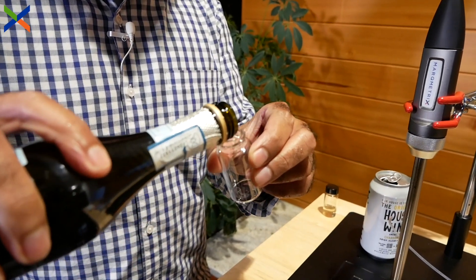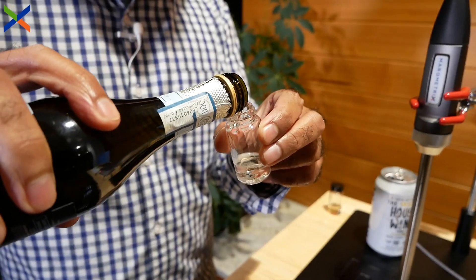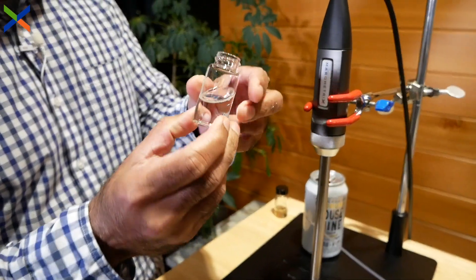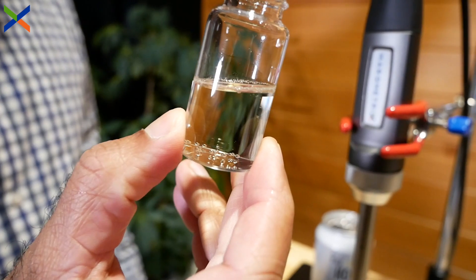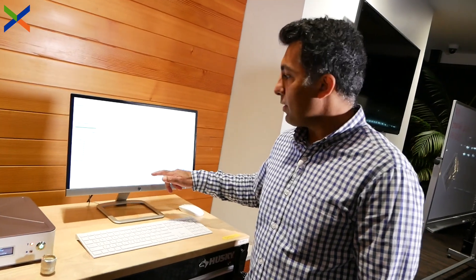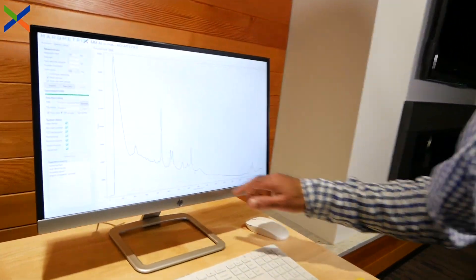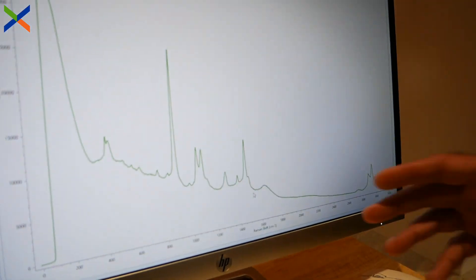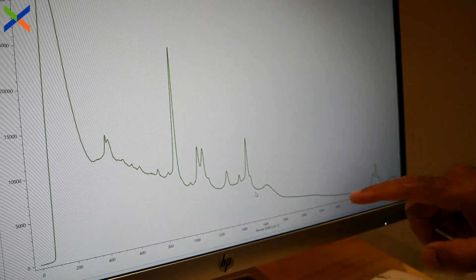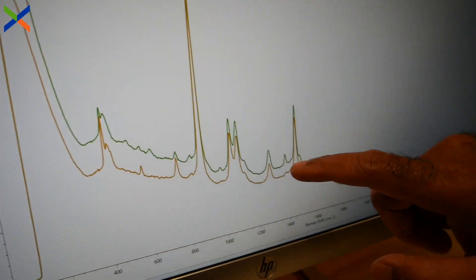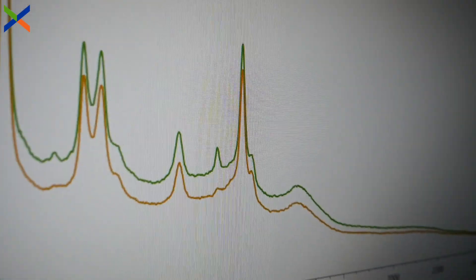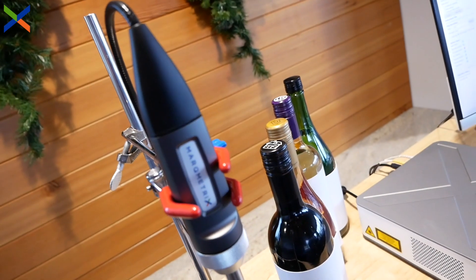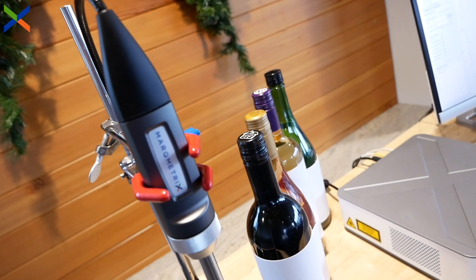We're going to pour some of this carbonated wine — a prosecco — into a little vial. You can see the carbonation. Here we have the Raman spectrum of the prosecco. What we see here are the peaks that belong to alcohol, and there's one peak that's very distinct right there that belongs to carbon dioxide.